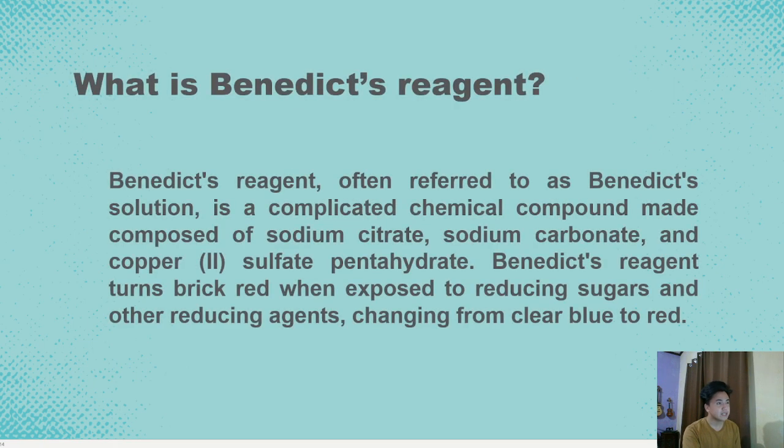So what is Benedict's reagent? Benedict's reagent, often referred to as Benedict's solution, is a complicated chemical compound composed of sodium citrate, sodium carbonate, and copper sulfate pentahydrate. Benedict's reagent turns brick red when exposed to reducing sugars and other reducing agents, changing from clear blue to red.